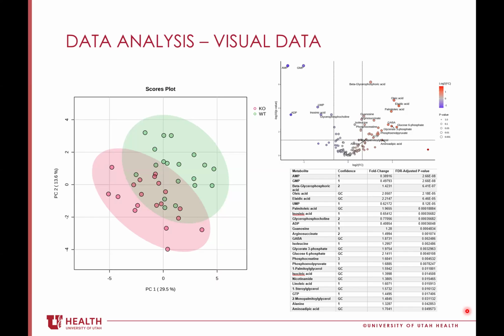Yeah. So going from that, I'll just tell you I have two favorite plots. One's a PCA analysis, and this is probably because I started 20 years ago doing this, and this is what everyone did, and they didn't really do anything else. And my second favorite plot is the volcano plot, and we usually include these two in every report we have.